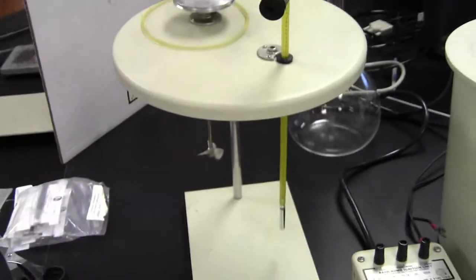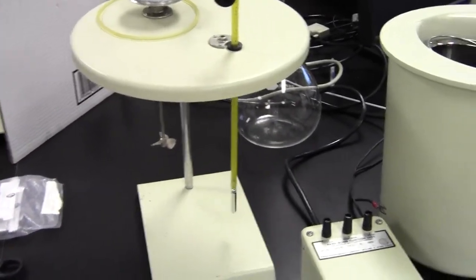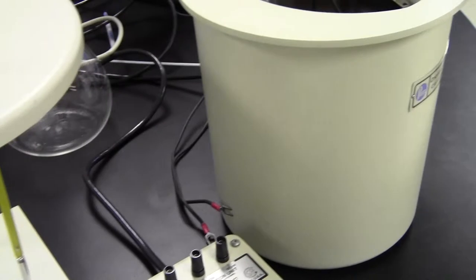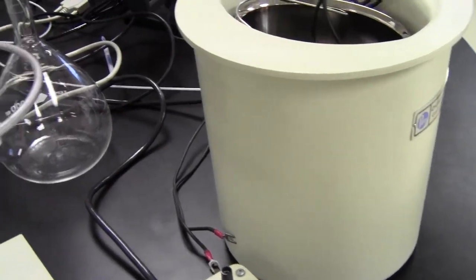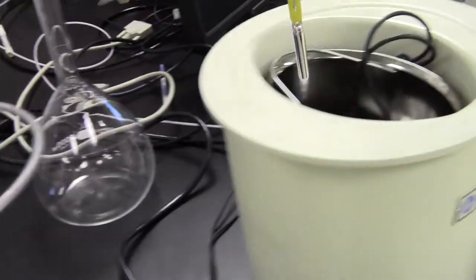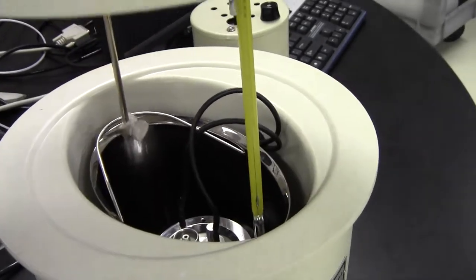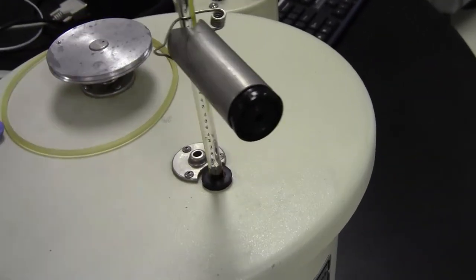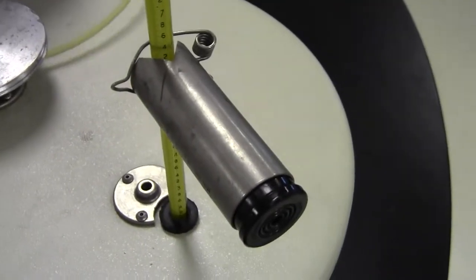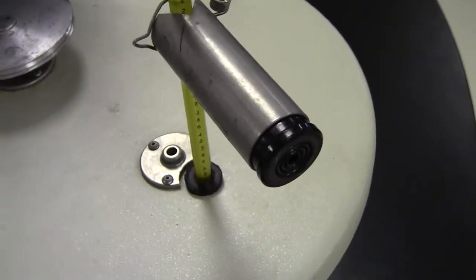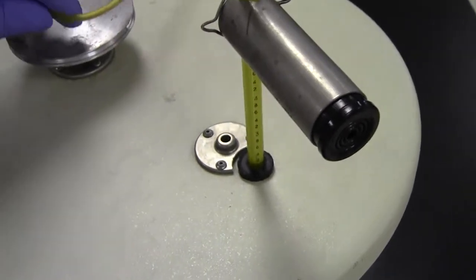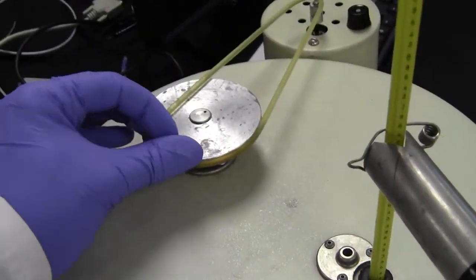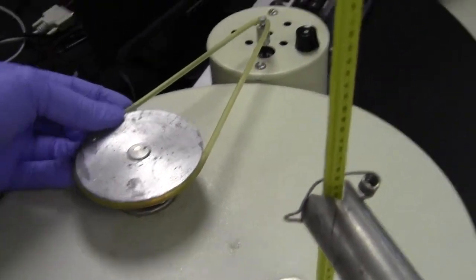So the lid also sits in its own stand to protect the thermometer from breaking. We'll lift it out of its stand and bring it over, and it will go on only one way. And that's good, and you'll just secure this. I'm trying to do it with one hand here. There we go.